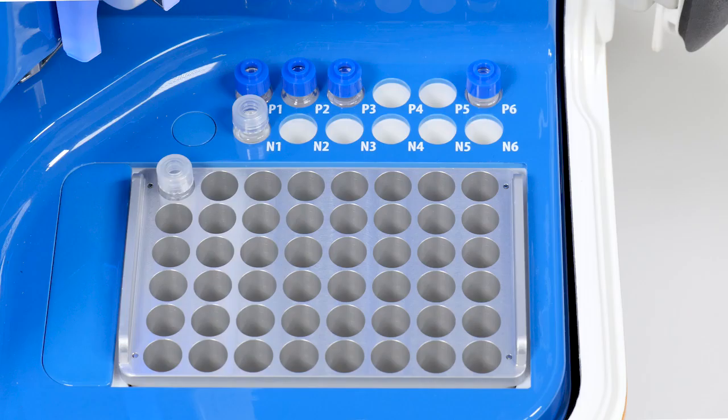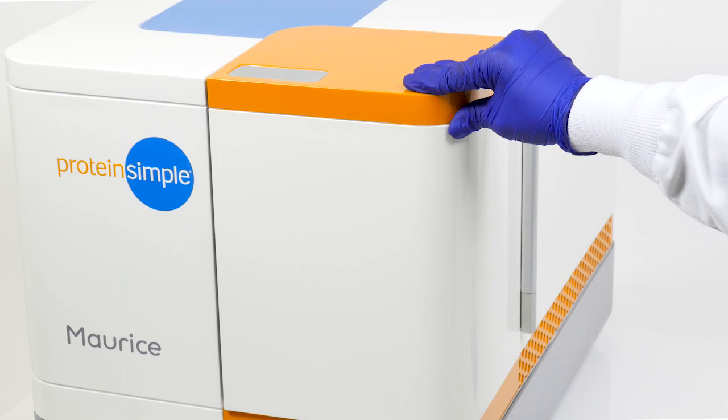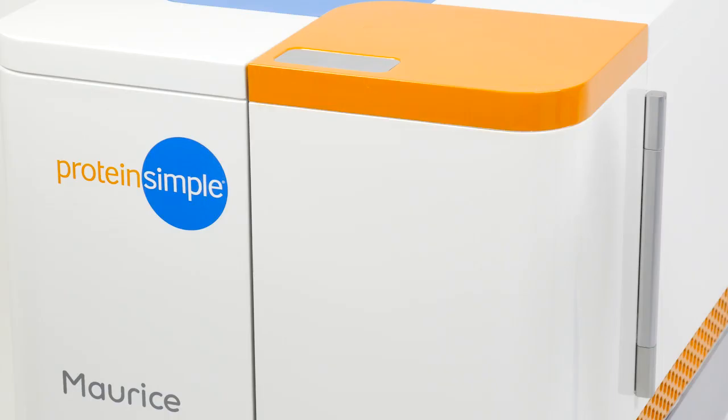Confirm that the light around the cartridge is blue, the reagents are all loaded in the correct places, and the sample is in place. Now close the door on Maurice, press the green start button, and the CIEF run for the system suitability peptides will begin.